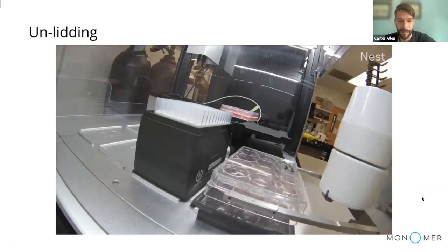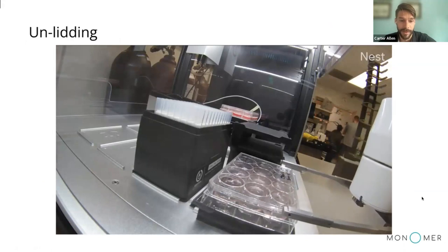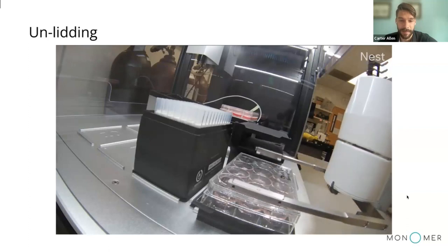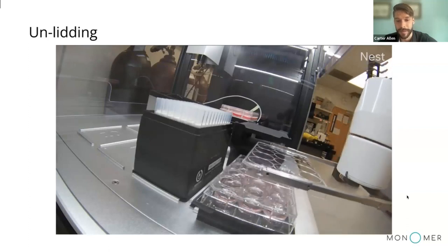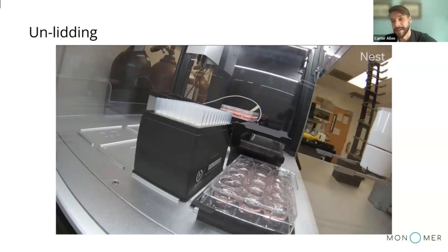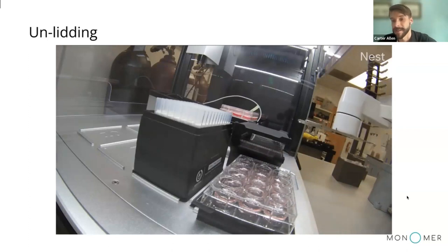This is a robotic arm loading the deck slot that we mentioned that has that offset, and then unlidding the plate. And you see this double lid holder. This allows for the lids to stay sterile as well. So we're not moving the lids off the deck, but we're not taking up more deck slots than we really want to.